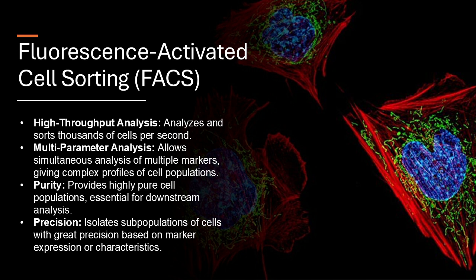That's a great way to put it. It's like we're zooming in on the building blocks of life itself, seeing all the intricate machinery that makes everything work, from our immune systems to how diseases develop, all that. Right. And with each new discovery, we understand more about how cells function, how they talk to each other, and how they respond to their environment. And this knowledge is helping us develop more targeted therapies, personalized medicine, and ultimately improving human health. It's amazing to think how FACS is helping us unlock these secrets and pave the way for these new breakthroughs.